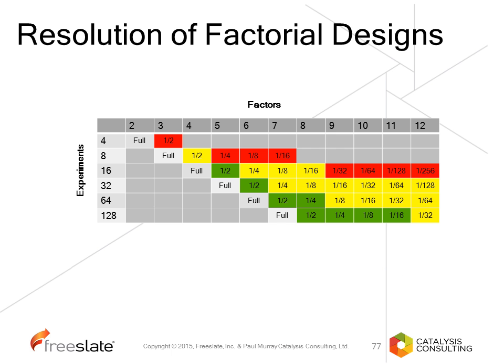So I already said that for 12 factors, you would be running over 4,000 experiments if you were to run each factor at a high and low level. Using fractional factorial designs, we can greatly reduce these numbers. This table will show you some information about how the number of factors relate to the experimental design. If you have 2 factors and you look at each factor at both levels, then that's 4 experiments.